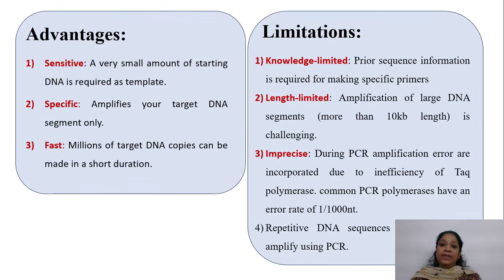Knowledge limited. PCR requires prior knowledge of the DNA sequence to design specific primers. Without this information, it is impossible to target a specific region of DNA. Length limited. Amplifying long DNA fragments, usually over 10 kilobases, can be challenging. Standard PCR is better suited for shorter sequences.